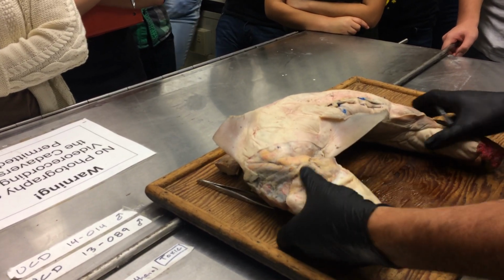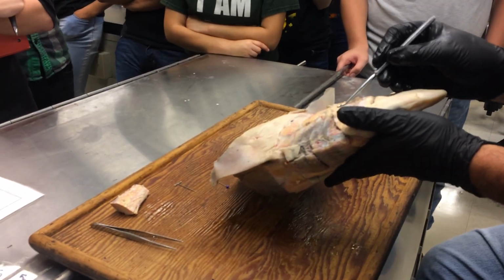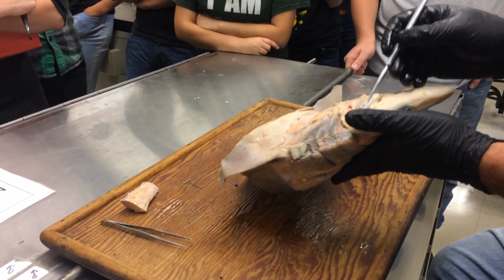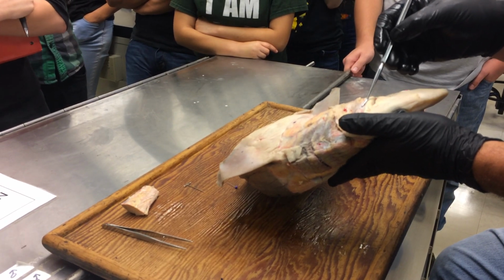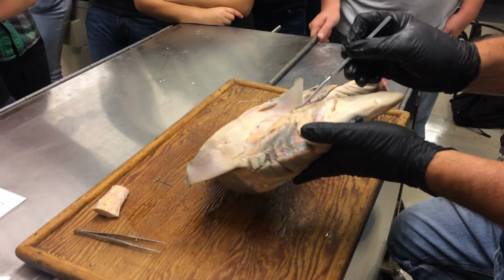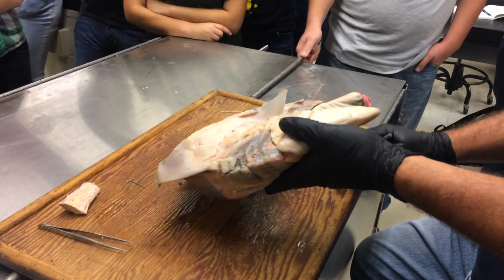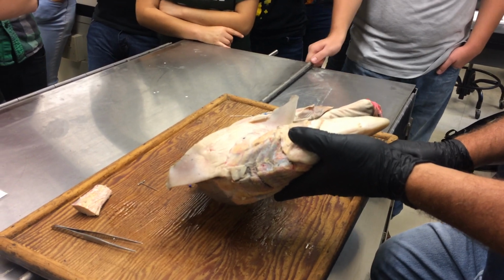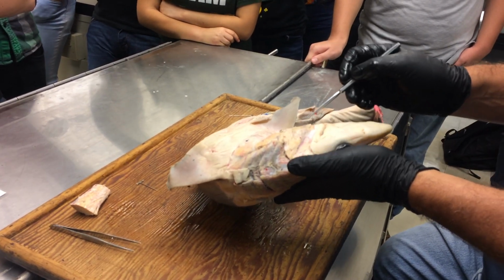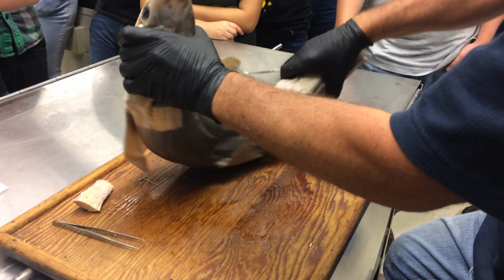So we'll start with one that everyone got to see last time because it was in the way. This big sheet of muscle that stretches across from the mandibular cartilage of one side to the mandibular cartilage of the other side, and that would be the intermandibularis. So which arch do you think that belongs to? Mandibular. Mandibular arch, okay. So that's mandibular arch muscle ventrally. And then the remaining mandibular arch muscles we see dorsally here.